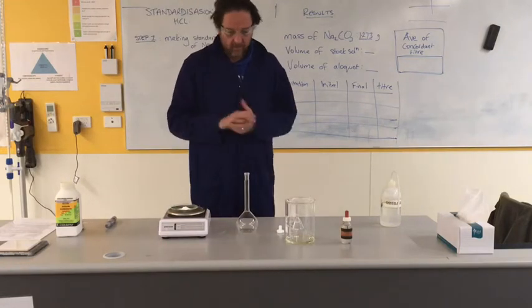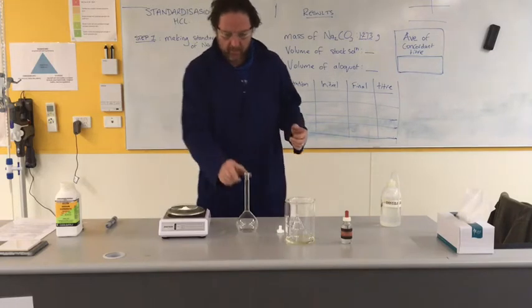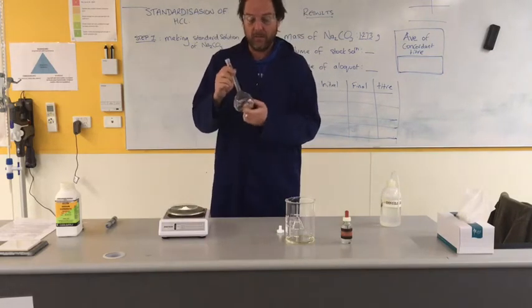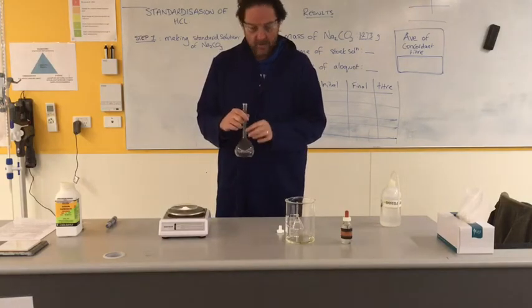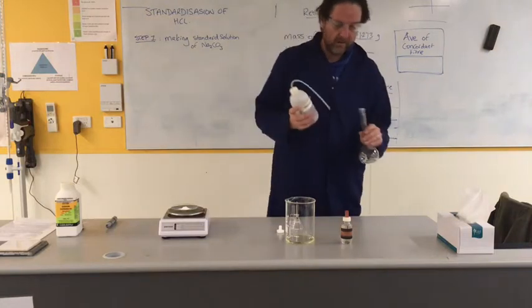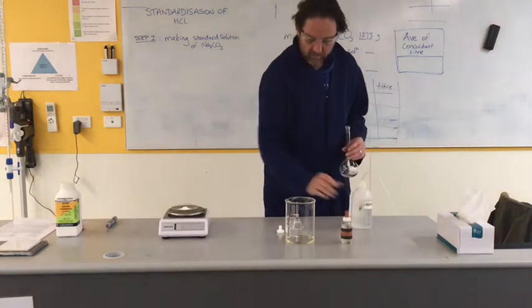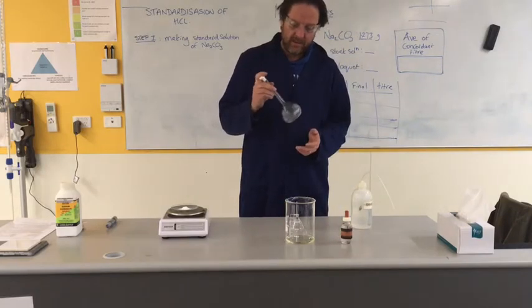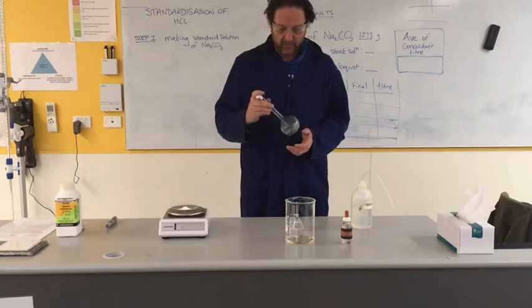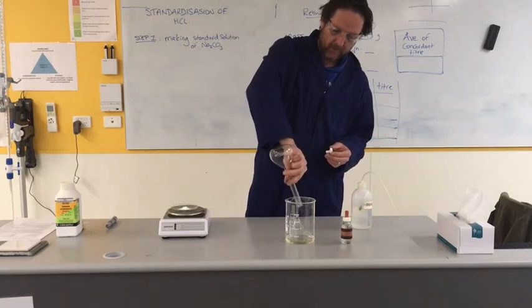Next I need to dissolve that to make it suitable to go into my burette. To do that I'm going to put it into this volumetric flask. This volumetric flask has a volume of 250.00 mls, but I just want to make sure it's all nice and clean because I don't know exactly what's been in it. So distilled water - I'm trying to swirl it around, just catching every surface. Maybe there's some tiny little bits of impurity in there.